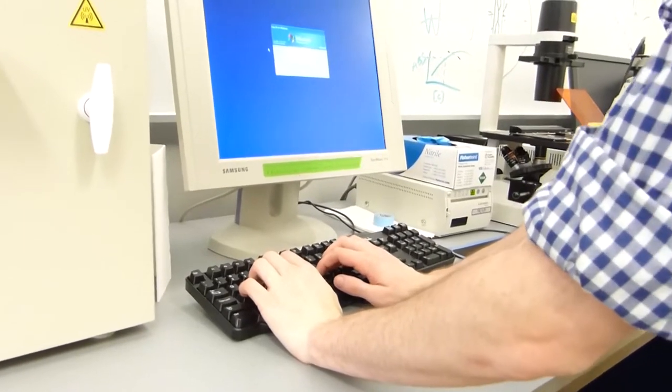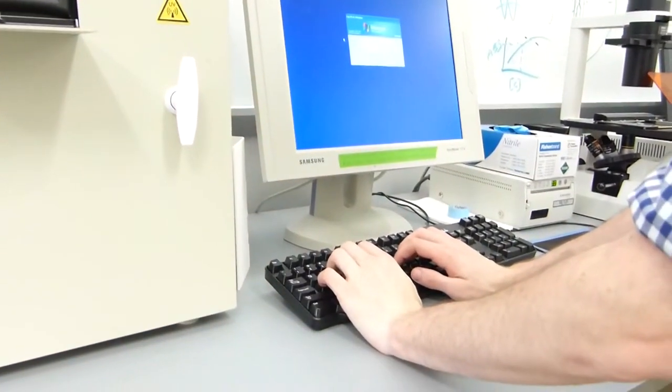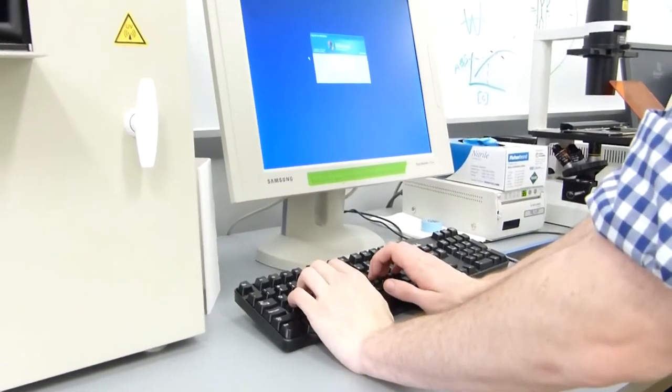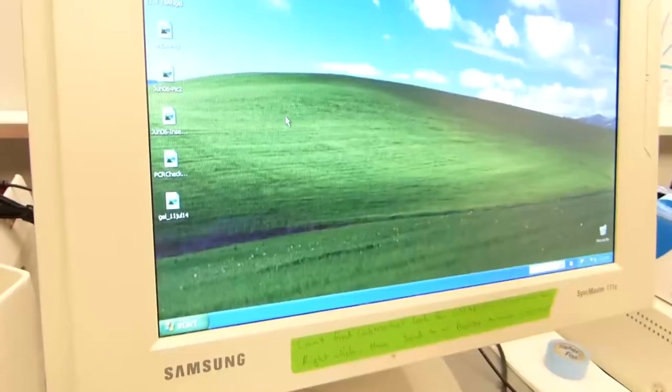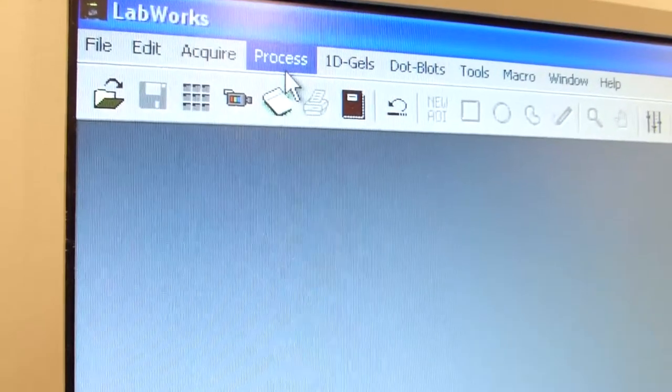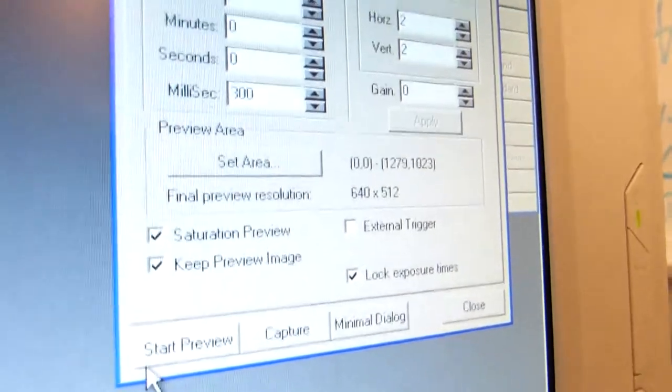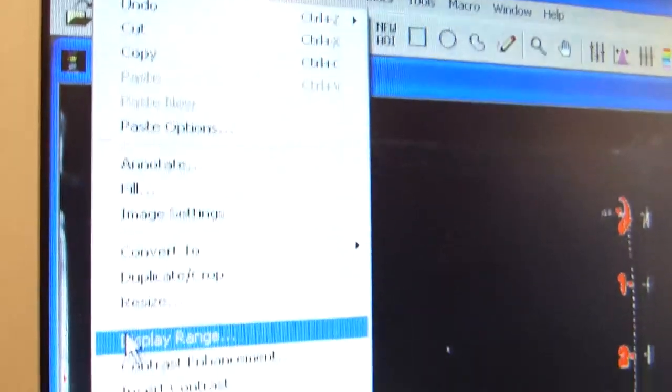You can then check your gel by looking inside the viewing frame here. Use the computer next to the imaging box to sign in. It may already be logged on for the class or you can use your own user name and login. Once you are logged in, go to the start menu and open LabWorks. You can close out this first window and then go to acquire video digital.